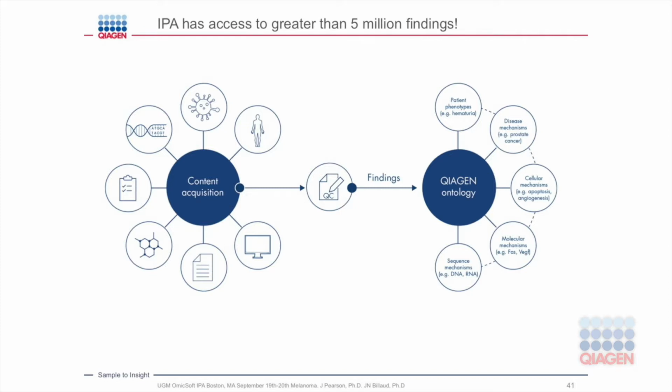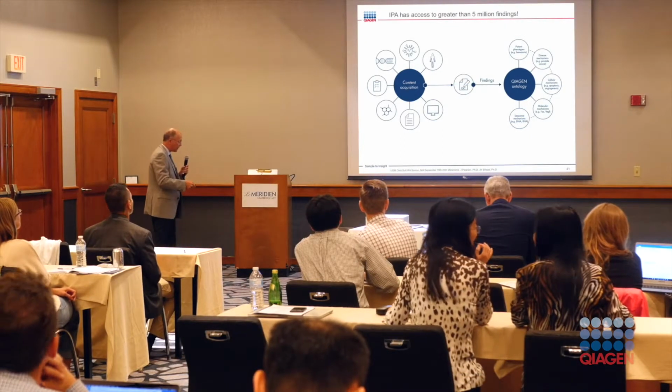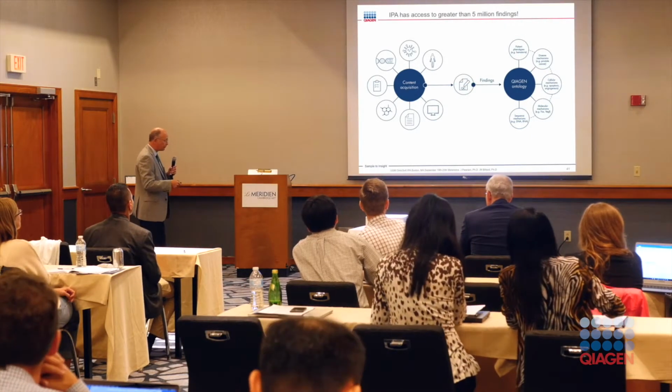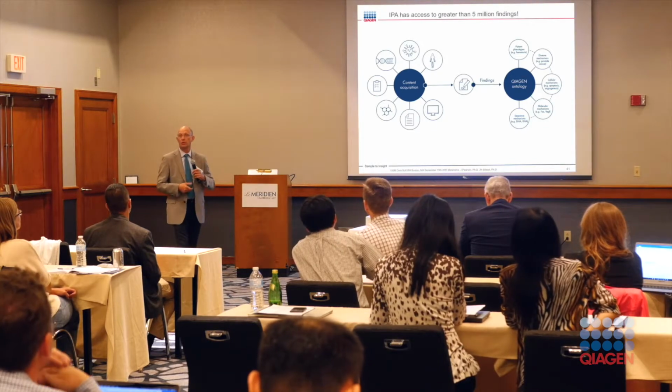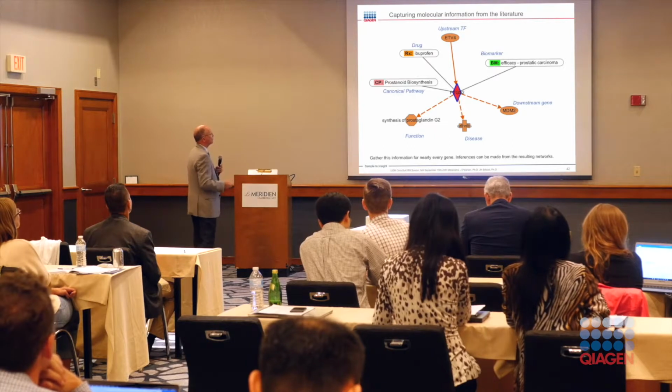The findings come from peer-reviewed papers and also from third-party databases. Everything is structured according to a certain ontology, so we have a very strong way of finding any type of scientific-based findings.